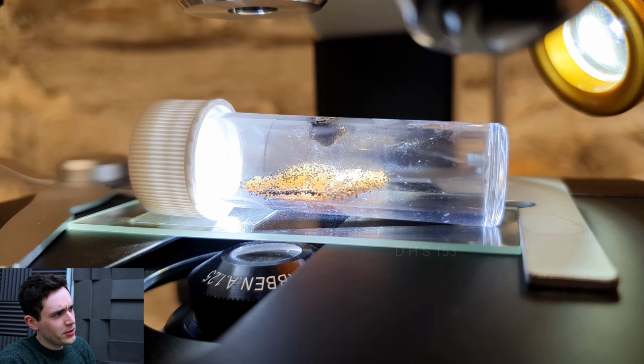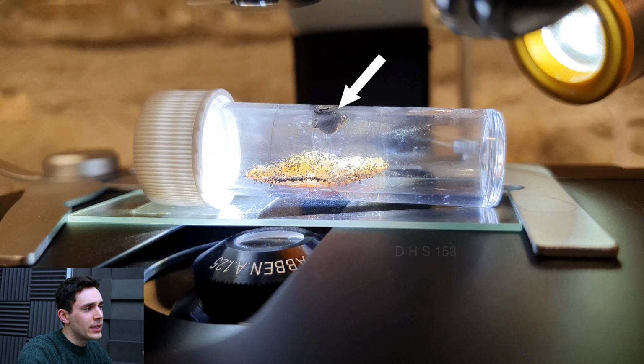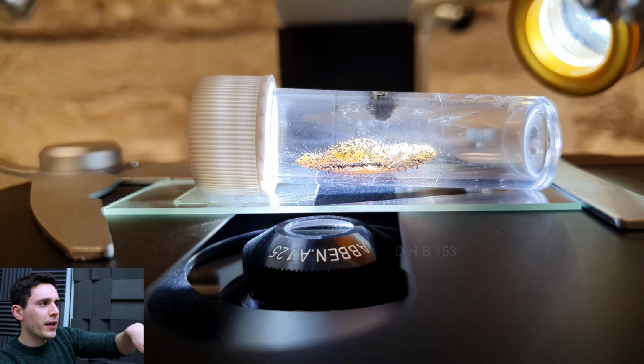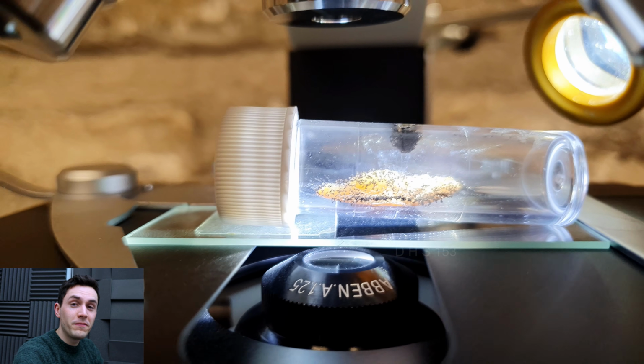What you're seeing in this test tube here, I'll just pause it, is that little black splodge is a piece of infected earwax that I harvested from a patient's ear ages ago. I suspected at the time it was fungal, but I wasn't entirely sure what species, so I stuck it in the test tube and lo and behold, it's grown a colony of fungus. And below that, that beige thing is a slice of apple that I decided to feed the fungus.